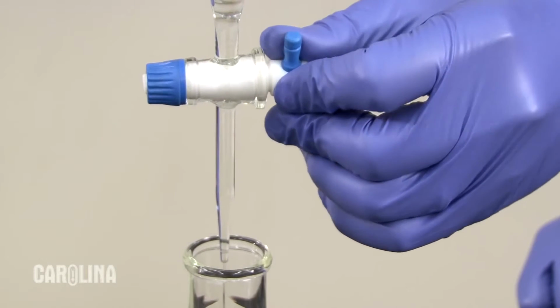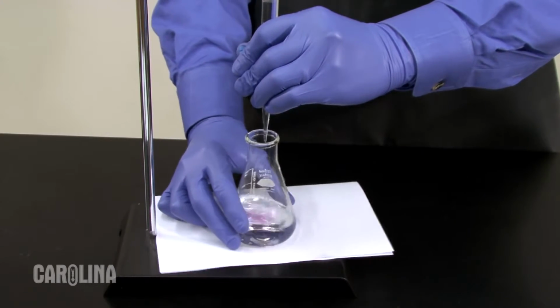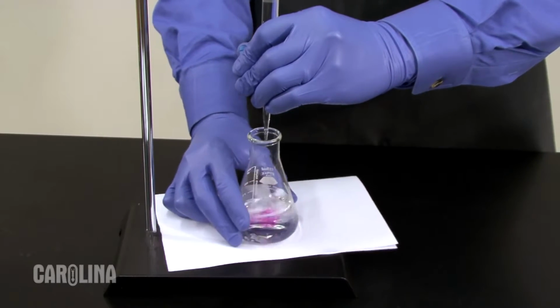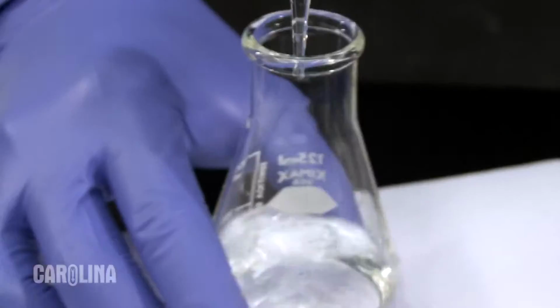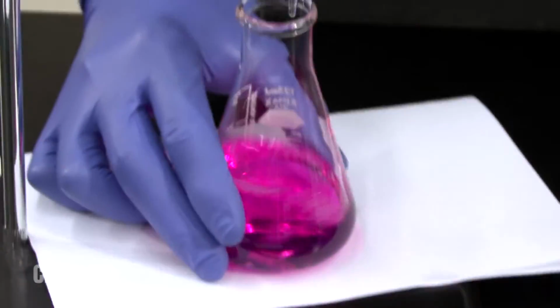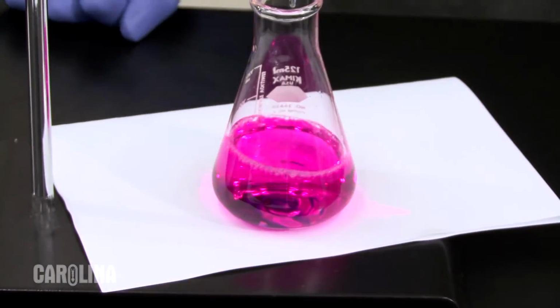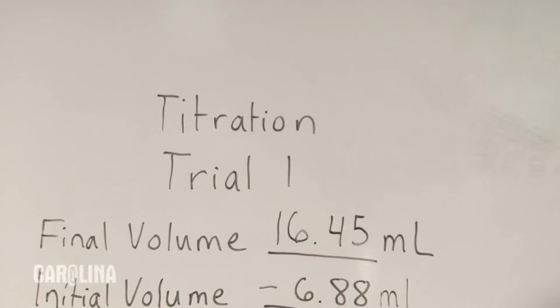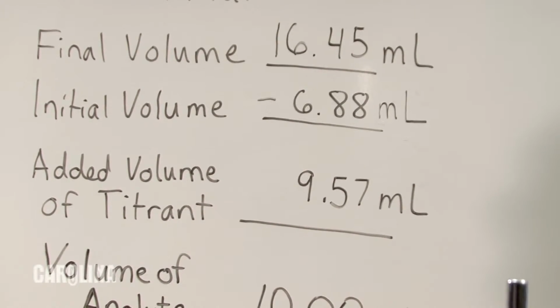It is common laboratory practice that the first titration is an estimate. Open up the stopcock and allow the titrant to enter the flask quickly. Continuously swirl the flask. As the volume of titrant in the flask increases, the color of the indicator appears, then disappears as you swirl. When the analyte becomes a colored solution, close the stopcock. Record the final volume of the burette. Subtract the initial volume from this final volume to get the estimated volume of titrant needed for this titration.